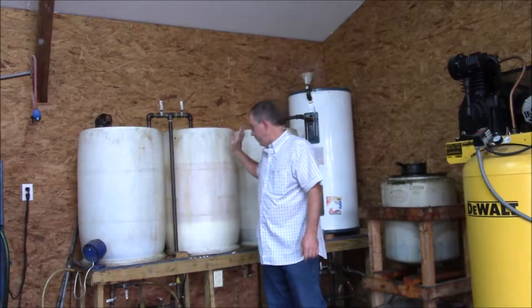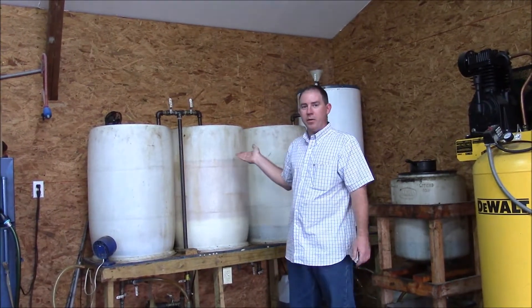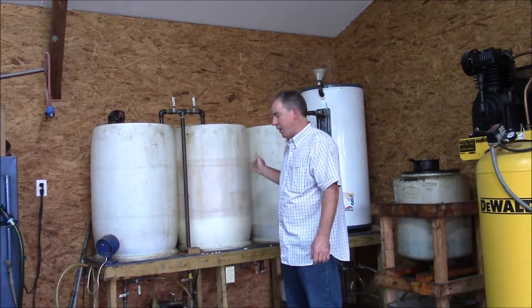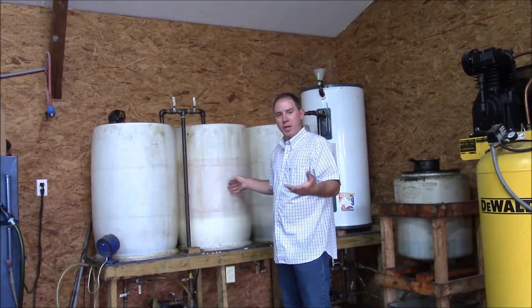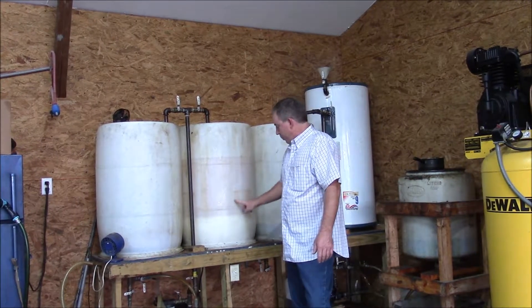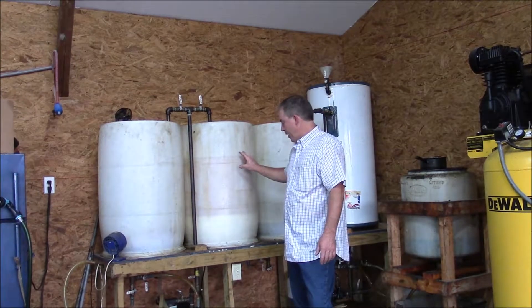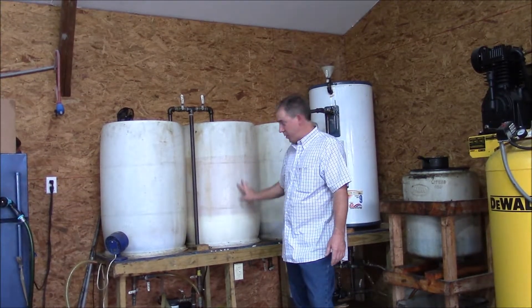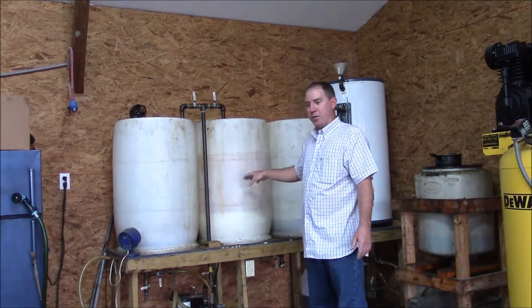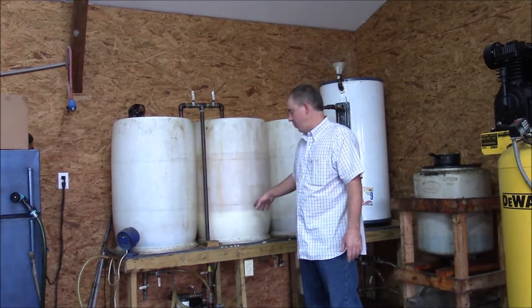In the washing vessel, we have a batch of biodiesel that was made about a week ago and it's been through a wash cycle already. What we're going to demonstrate today is a traditional wash cycle in this apparatus. When we first put it in here, there was a lot of methanol, a lot of soap, and some lye residue. So the first wash we did, the biodiesel product actually turned a really light creamy color, which is usually what happens on the first wash.